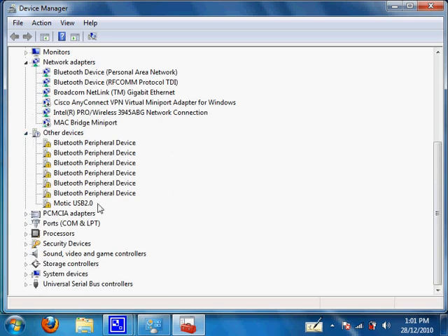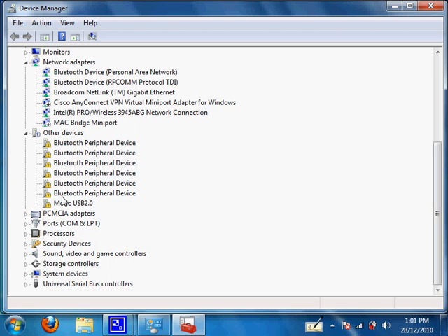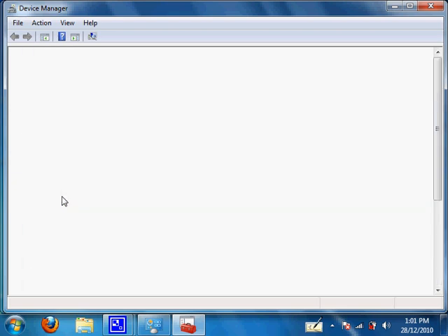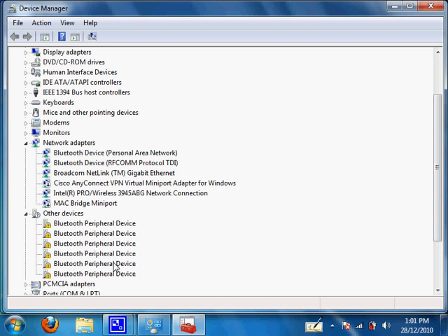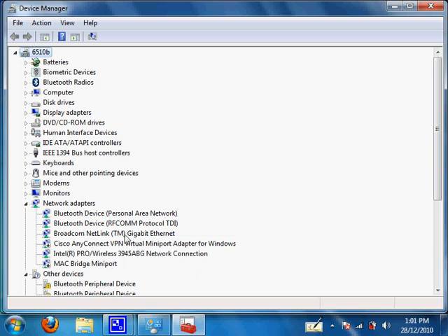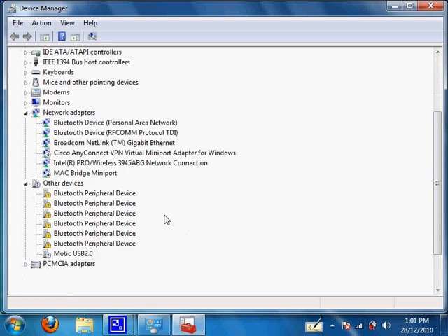How we know for sure that Motec USB 2.0 is the Motec Cam 2300 that I have is to unplug the USB cable. Device manager should refresh itself and Motec USB 2.0 should disappear. Now we know for sure that we have located our device.